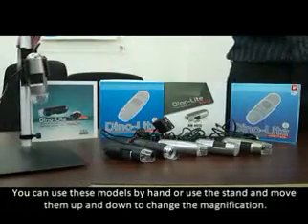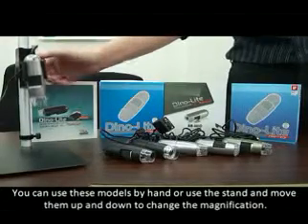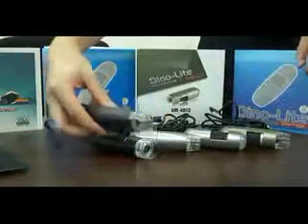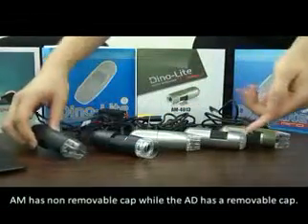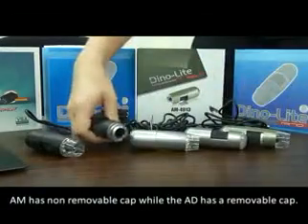You can use these models by hand, or use the stand, and move them up and down to change the magnification. The AM has a non-removable cap, while the AD has a removable cap.